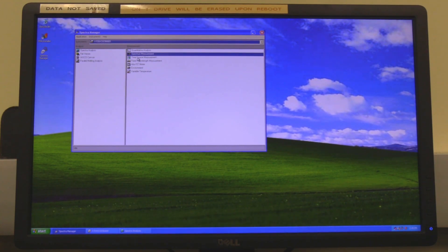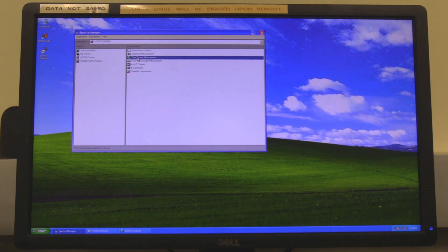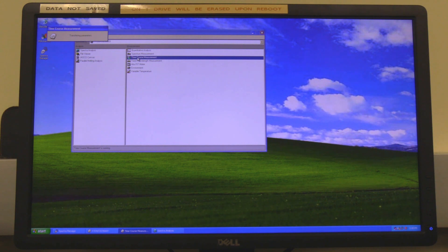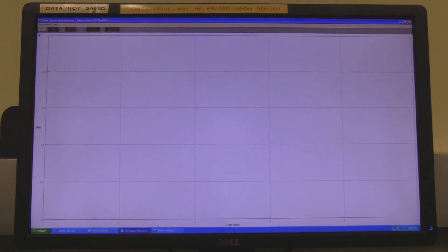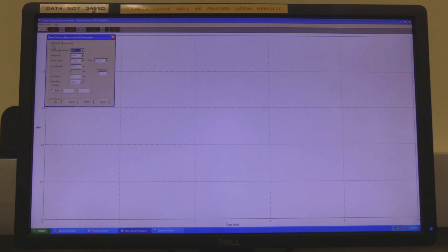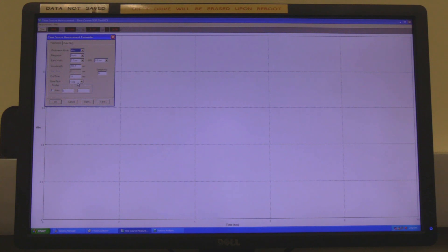Time course measurements, first order kinetics. In spectra manager, double click on time course measurements. Wait for the software to open and initialize. If this is the first time the computer is communicating with the instrument, the initialization process will take a few minutes. Click on measurement and then on parameters. The parameters window will open. Set the photometric mode, response, bandwidth and wavelength. In end time, set the duration of the measurement. Data pitch is used to set the data collection interval.